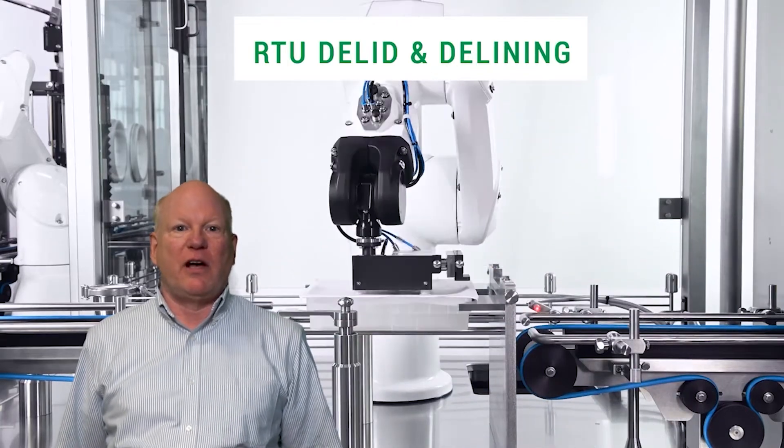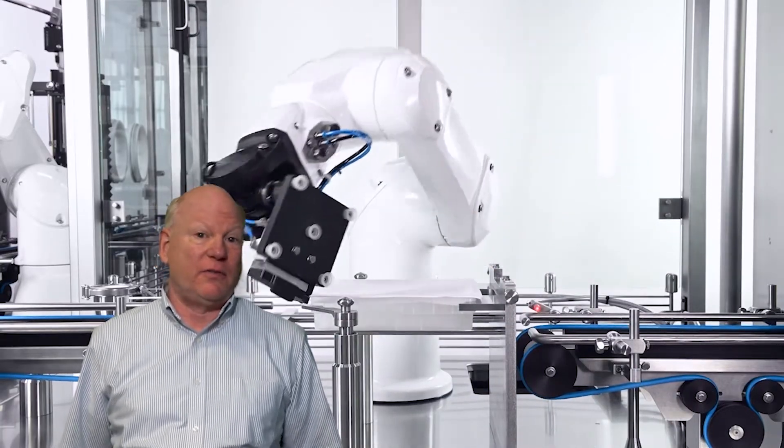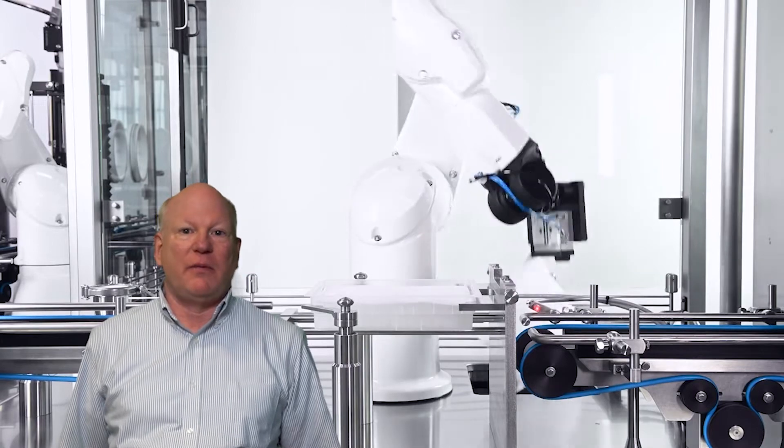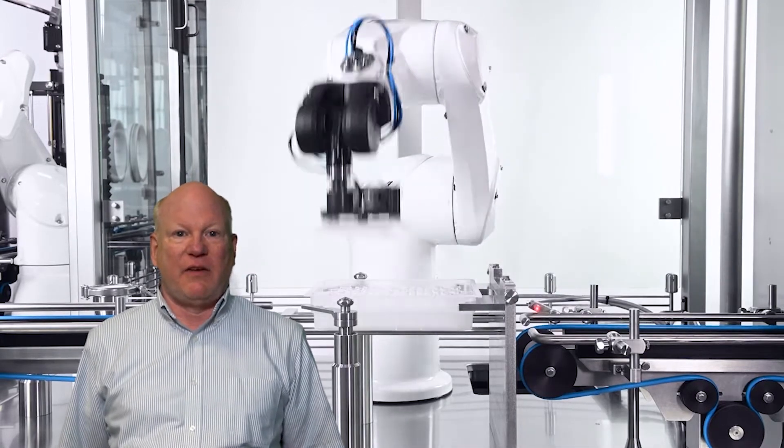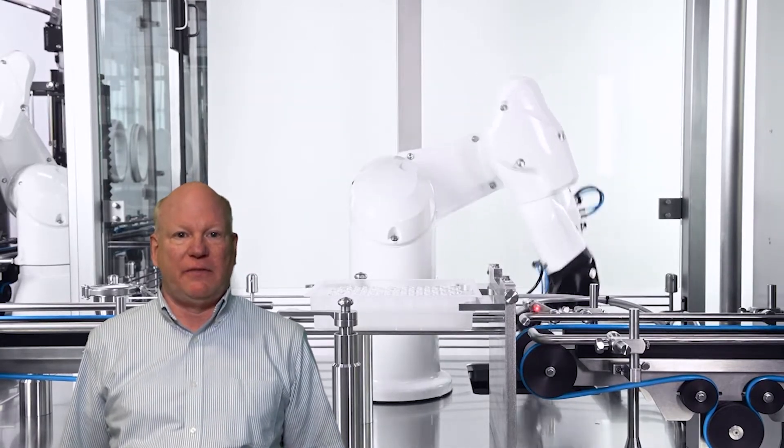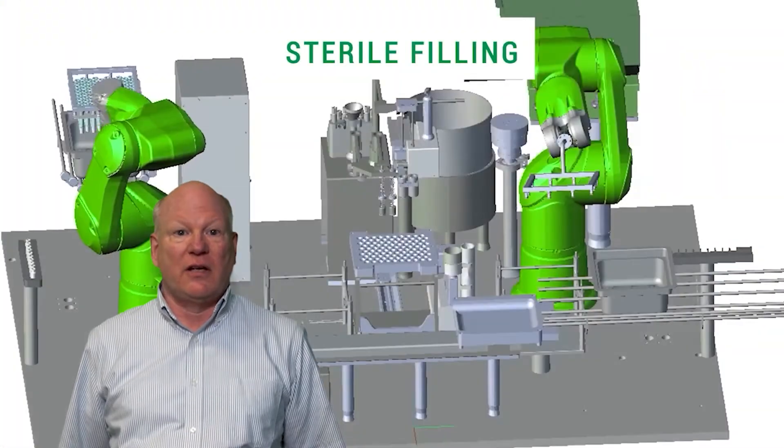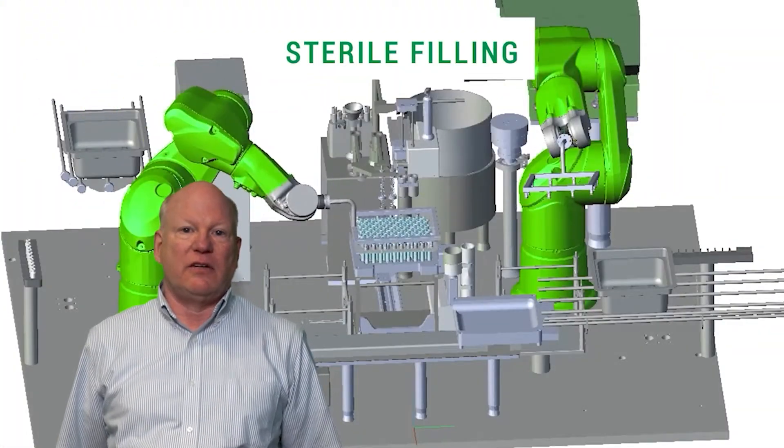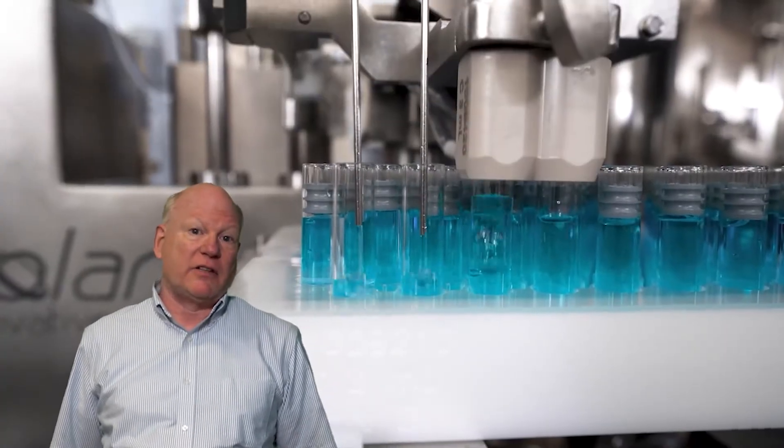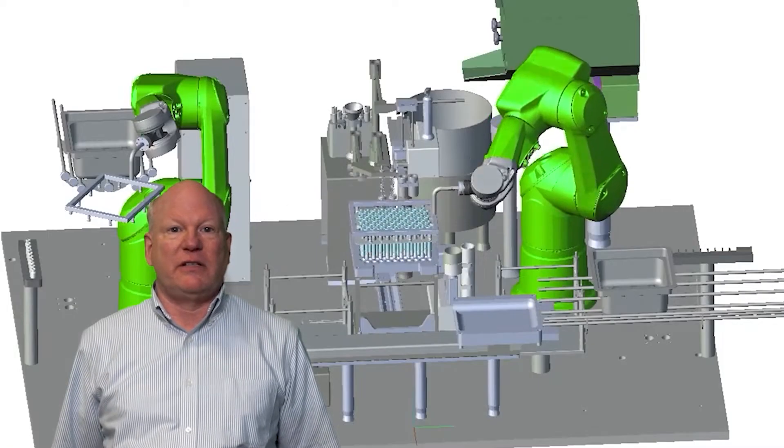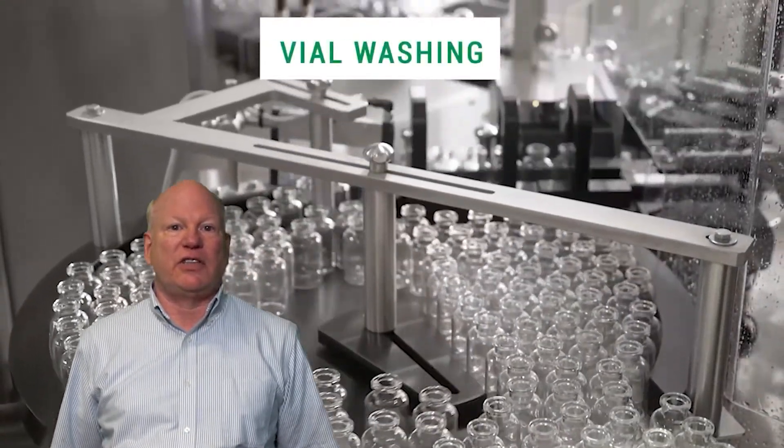Hi, I'm Tyler Rush, the Vice President of Manufacturing. I oversee all the manufacturing at BSM, and I've been on the BSM team for three years. This is our new fully automated filling unit. It uses four robotic arms, several automated transport systems, advanced technology to automatically fill up to 90,000 vials, syringes and cartridges in a single production run. It can also freeze-dry temperature-sensitive drug products to extend their shelf life.